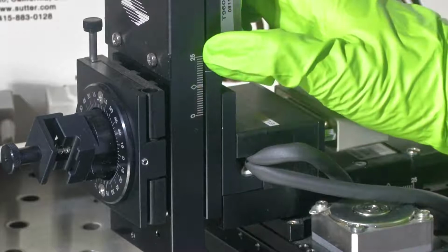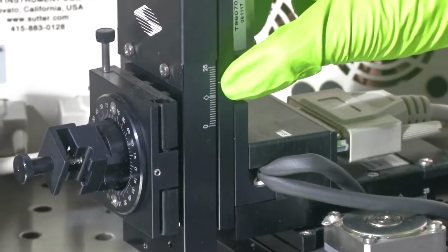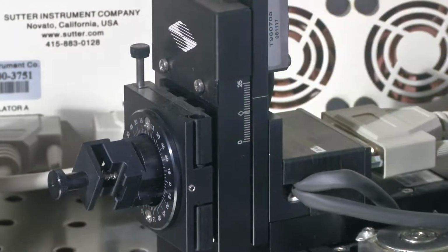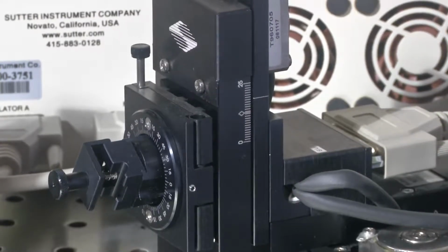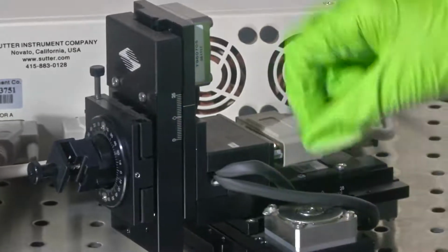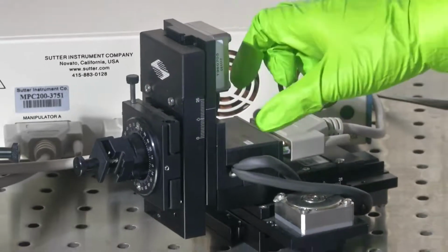This indicates that the entire manipulator can provide precision up to 25,000 micron. So, you could get access to each micron change in the distance in the x, y and z axis.